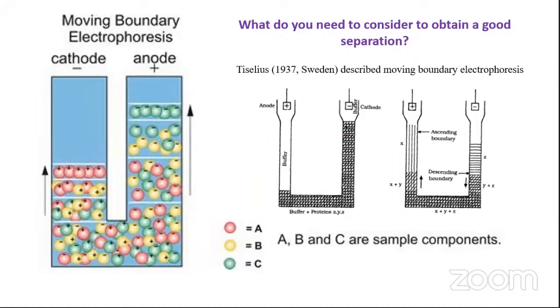Okay. Imagine now that this is the same single tube here. It ends here. You place an anode here. How will you place pure buffer here? Did you get the question? So how will we make the inflow and outlet of buffer pure?